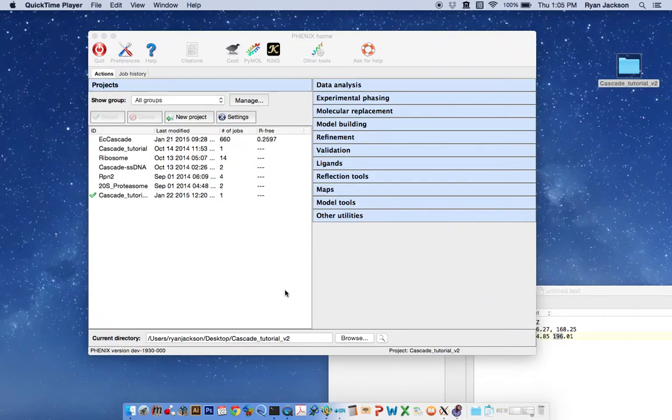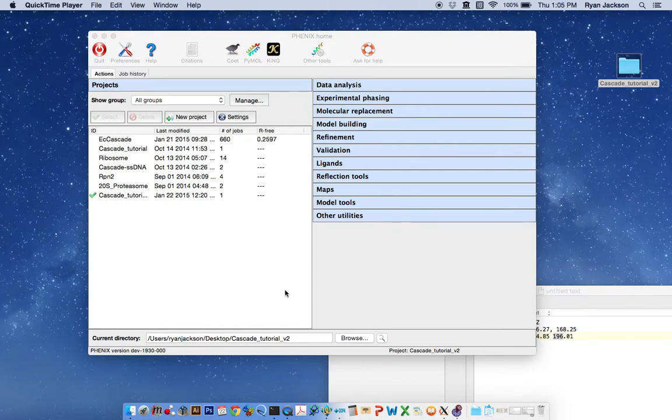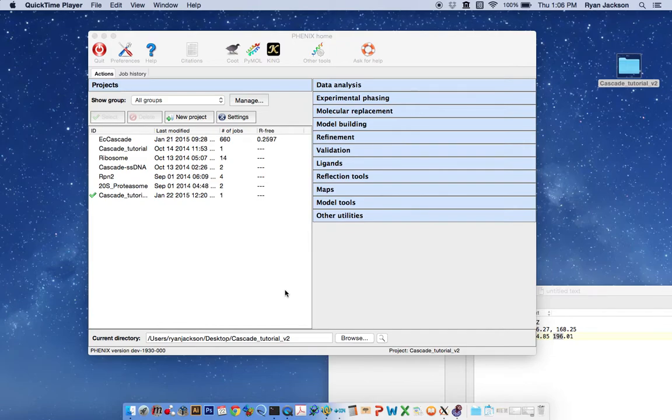Okay, this is supplemental movie tutorial 2 associated with Nature Protocol's X-ray structure determination using low-resolution EM maps for molecular replacement. Here we're going to use molecular replacement to solve the X-ray crystal structure of Cascade.